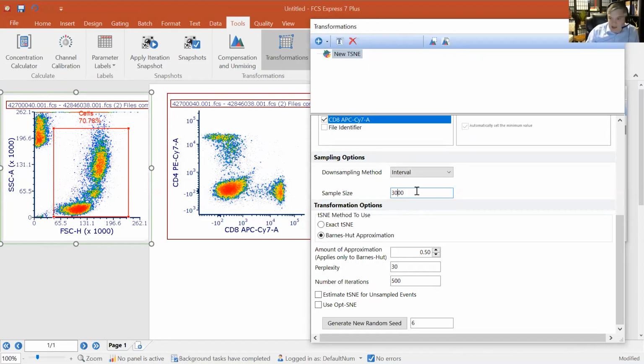Now, we set a default here of 3,000. That's not some sort of empirical way of setting this. We literally just chose a random point to say this is going to be our default, right? The default could be 3,000, it could be 50,000, it could be 500,000.